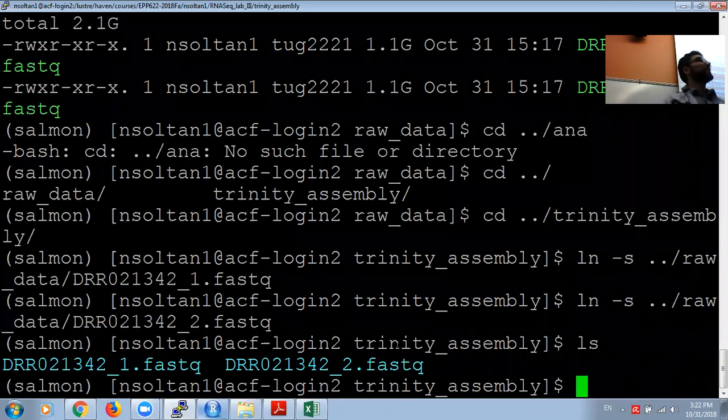Then the left and the right reads. And the SS library type means FR or RF, which means, for example, forward and reverse. In our case, it's exactly FR, which means that the forward read is number 1 and the second one is the reverse read. And the number of CPUs in this case we define as 1.